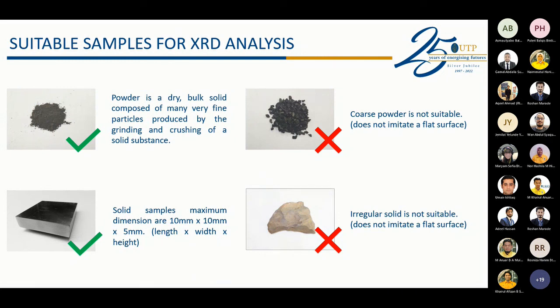If the sample is bigger than the maximum size, we cannot perform it in our XRD because the sample holder cannot hold the sample. And coarse powder and irregular solids are not suitable because they do not form a flat surface.